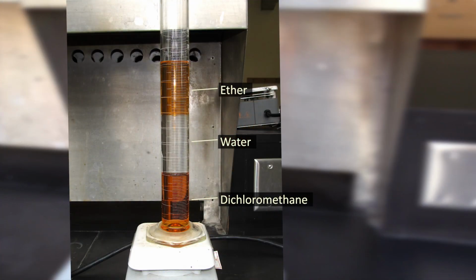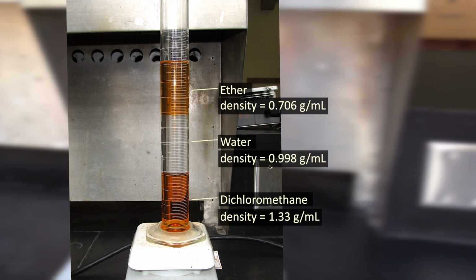Note that the lower layer isn't necessarily the aqueous one. This depends on the density of the organic solvent you use. If that solvent has a higher density than water, then the organic solvent will be on bottom.